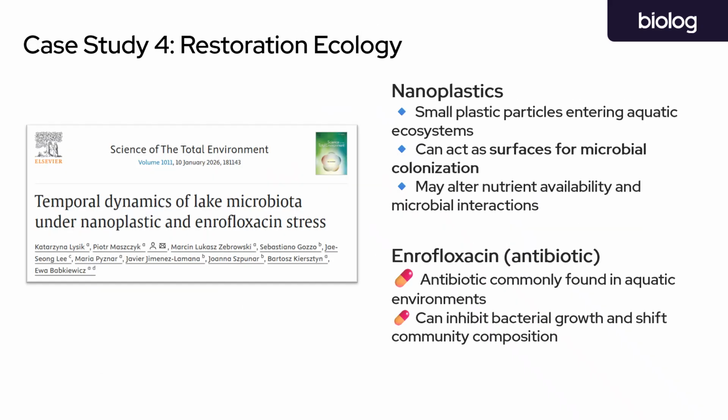And next, we have my personal favorite. This is a restoration ecology paper. And in here, the authors used EcoPlates to study the microbial response to environmental stressors like nanoplastics and antibiotics. And it turns out that nanoplastics are these small plastic particles that are being released by our current usage of plastics, and they can actually influence how nutrients are available to microbes.